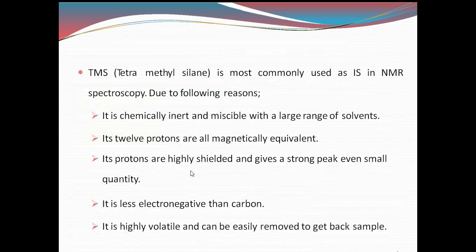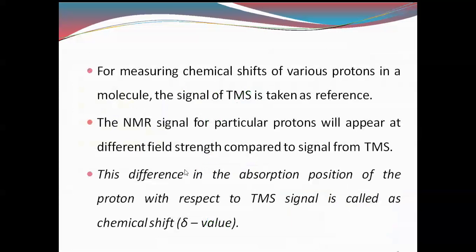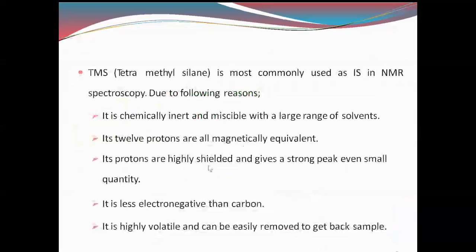That means they will not be surrounded by the different molecules. And each proton is highly shielded and it gives a strong peak even in a small quantity. They are less electronegative when compared with carbon, and TMS is highly volatile and can be easily removed, so we can get the sample back.